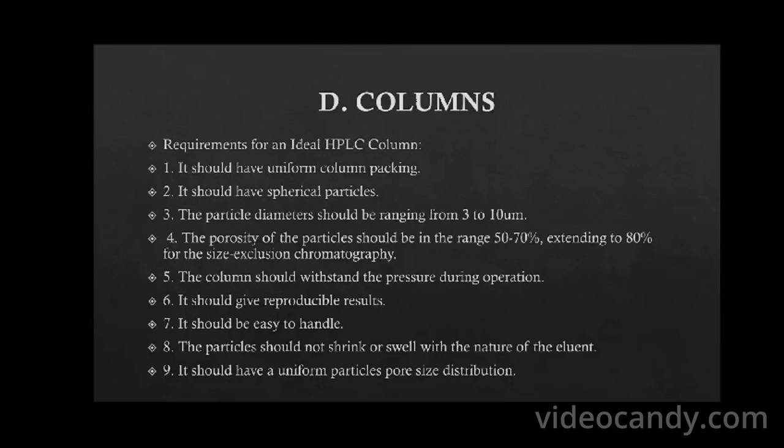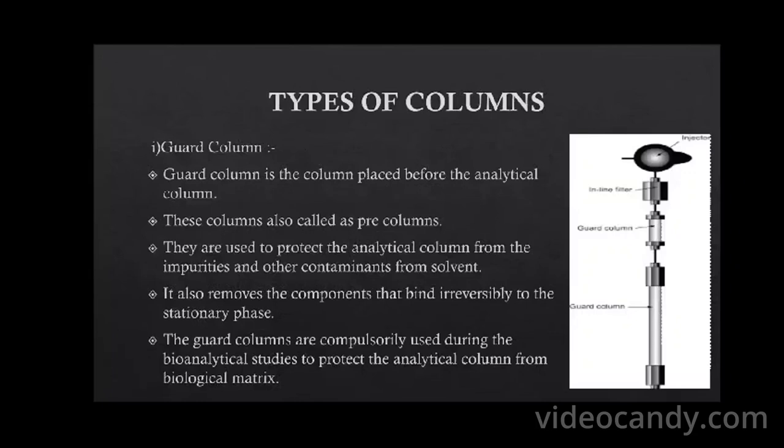It should give reproducible results. It should be easy to handle. The particles should not shrink or swell with the nature of the eluent. It should have a uniform particle pore size distribution.